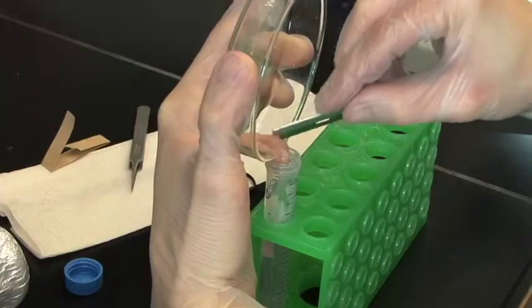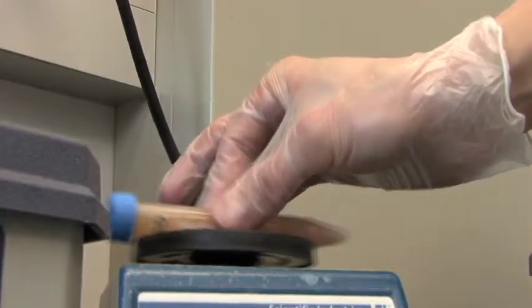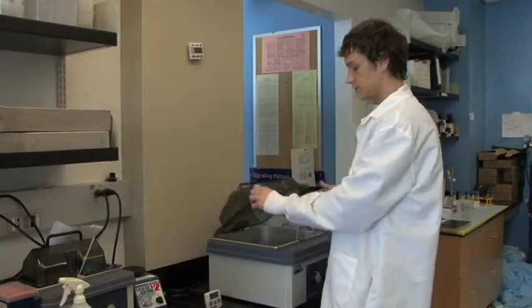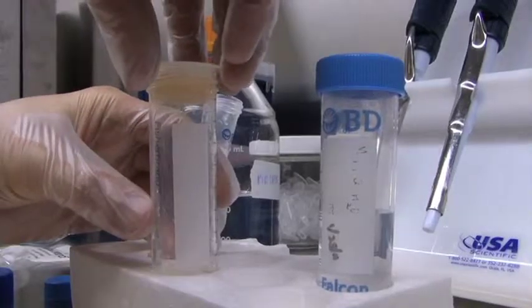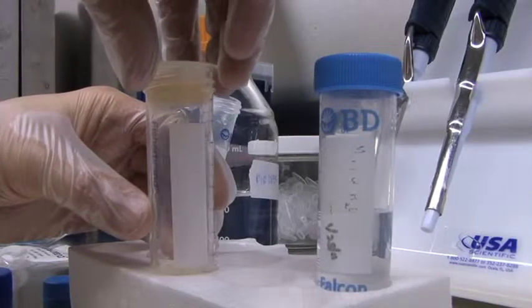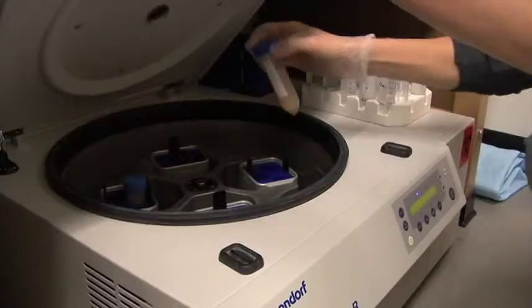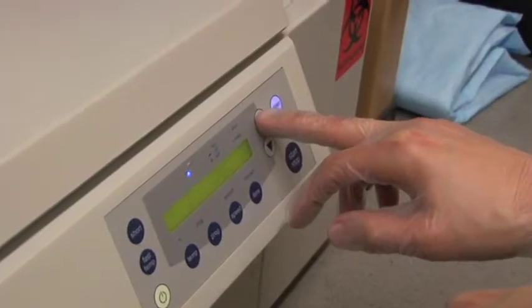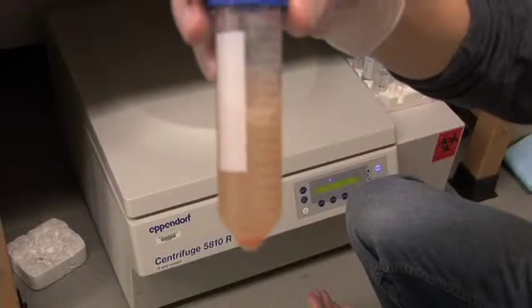A mixture is made containing enzymes to help break down collagen and connective tissues. The mixture is then incubated for an hour. Filtering the mixture separates the muscle cells from other unwanted tissues. A centrifuge is used to spin down the muscle cells, separating them from the liquid used during filtering.